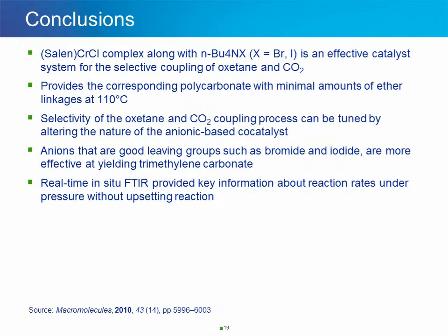I will conclude by saying that real-time in situ FTIR played a crucial role in understanding reaction mechanism and pathway by allowing the researchers to collect valuable information about reaction kinetics and the rates of formation of the TMC and poly-TMC in a pressure reactor without having to perturb the reaction and upset the reaction conditions, which happens when taking samples for offline analysis.